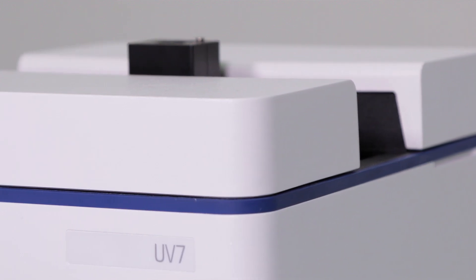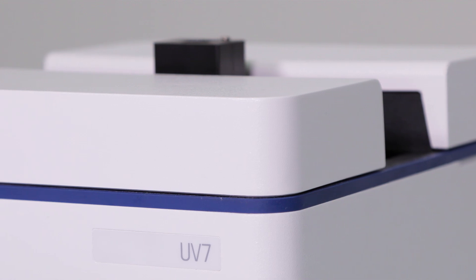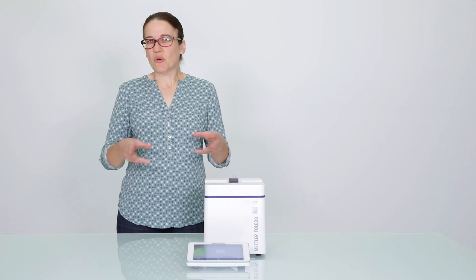Well, I'm here to tell you that this is much more than a simple box. This is a spectrophotometer. A spectro-what?